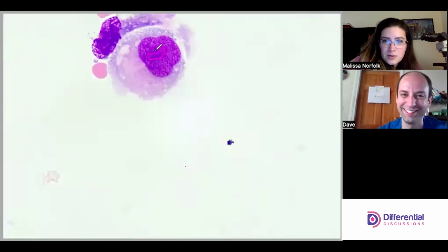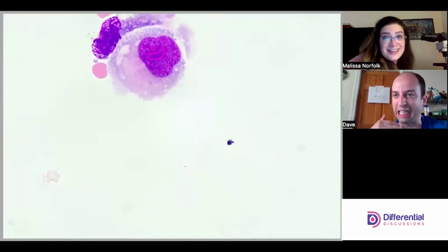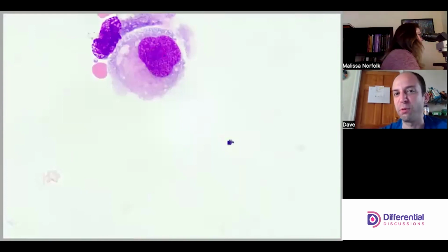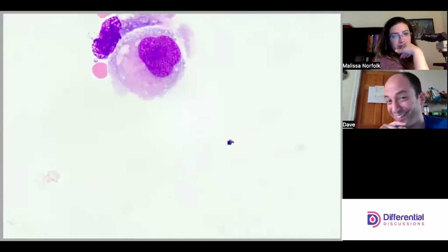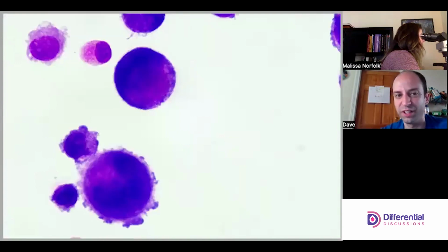And then you've got this other one right there. For a nucleoli, not good. This one has prettier contours, but still... Yes, and you can see the chromatin, but it still doesn't look normal. Yeah, definitely not. And again, a lot of these are looking like tissue cells, and we should not be seeing tissue cells for this.